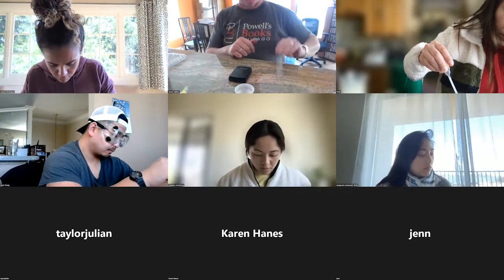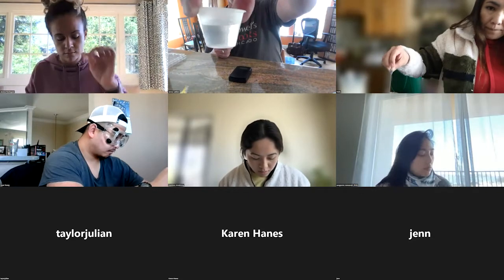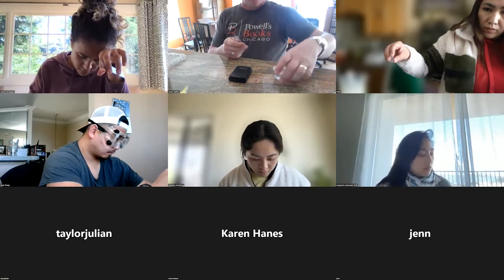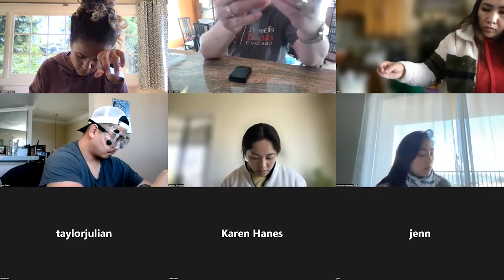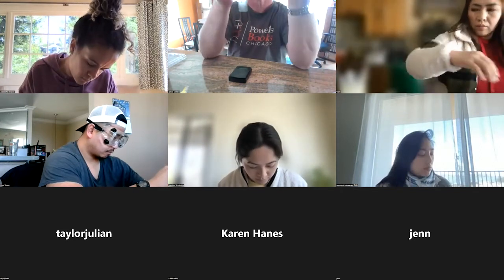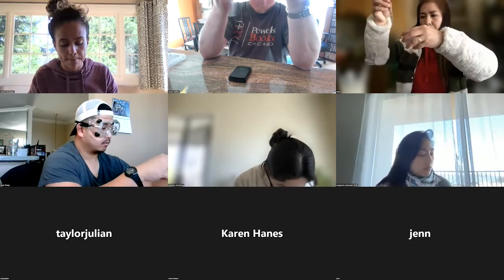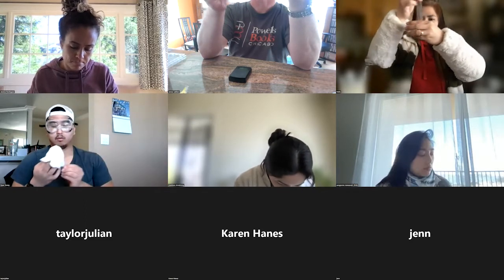So this is the distance we're going to be measuring here, from the bottom of the cup up to that 20 mil mark, or wherever it is. I'm just going to measure that. You're going to want to measure it in millimeters. And it looks to be, there's a 0 in this thing.